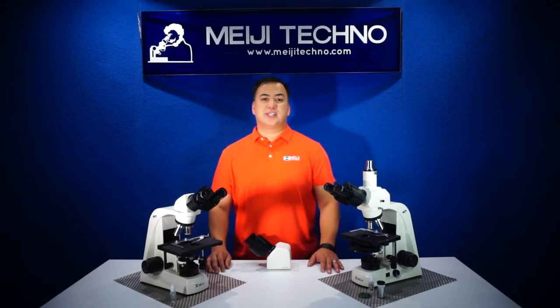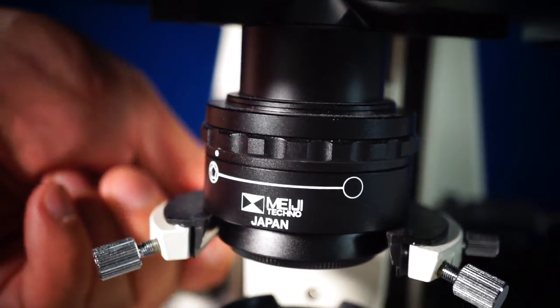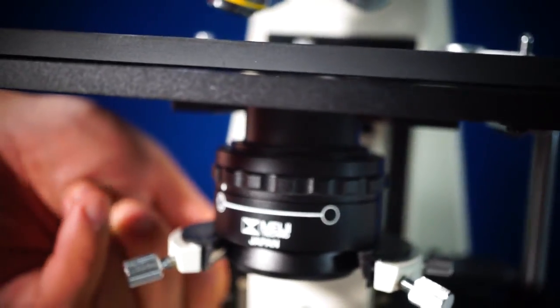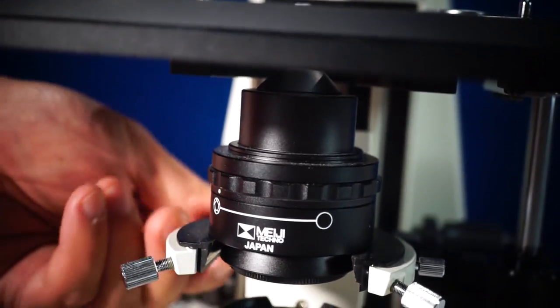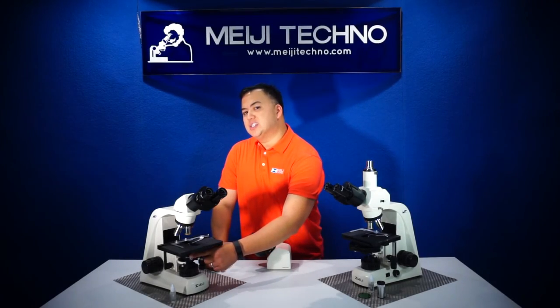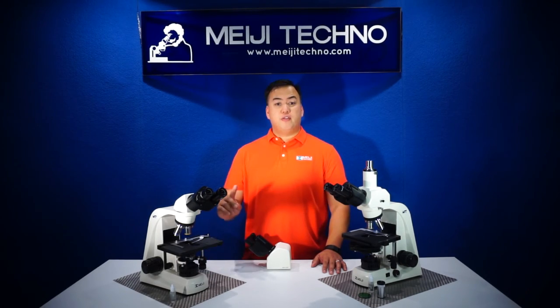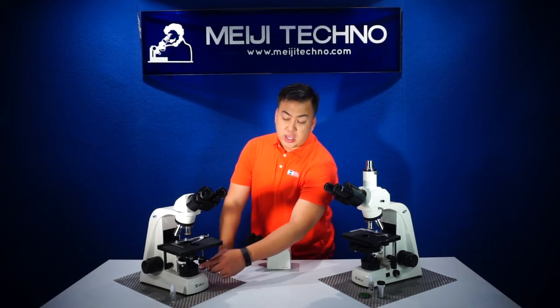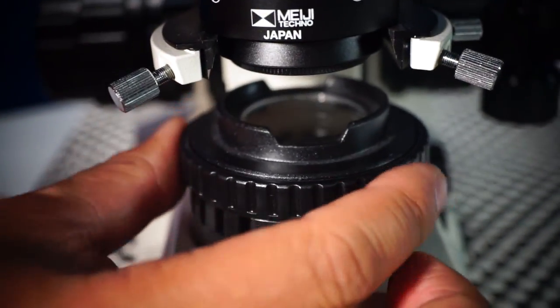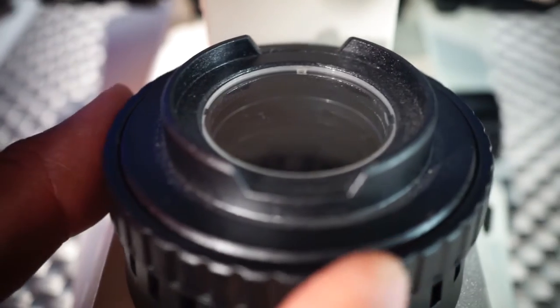The MT4000 employs an all-new condenser design with a quick-change dovetail mount, as you can see here, making it easier for users to switch between condensers quickly and easily. The condensers also have a built-in iris. The MT4000 series features a redesigned field iris as well, located on the bottom of the base, protected by a glass overlay so there's no chance of the iris being poked or going out of alignment.